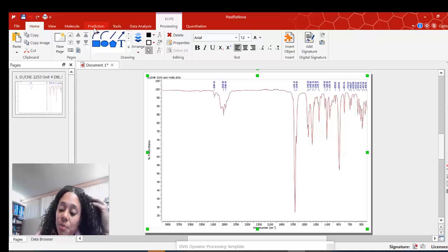So what we're going to do is, if you want it really quickly, you can save it on a flash drive and then put it on your computer as well. Or if you wait, about once a week I copy those files over, and then you can download it from the link that's in the IR tab in your notebook.